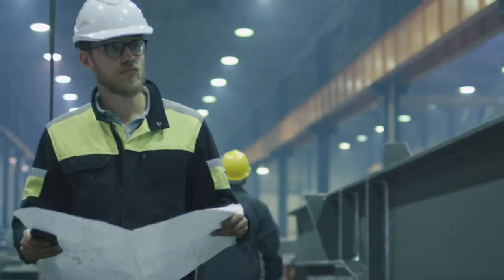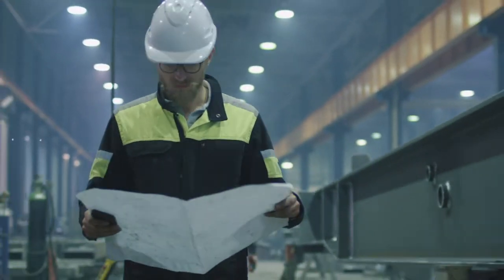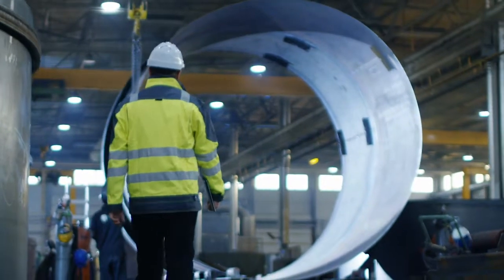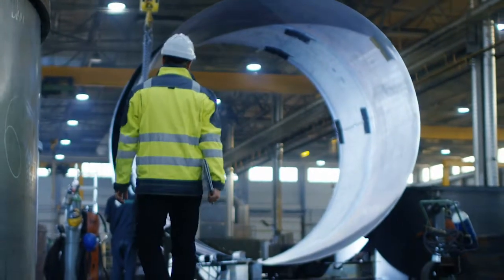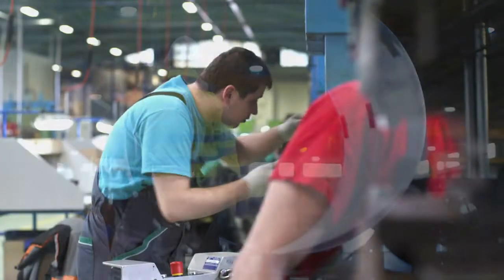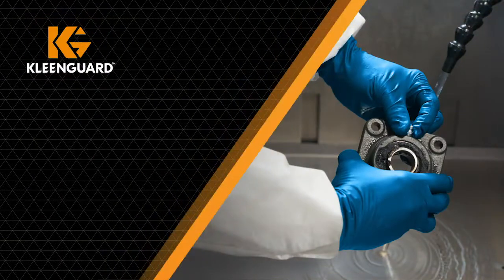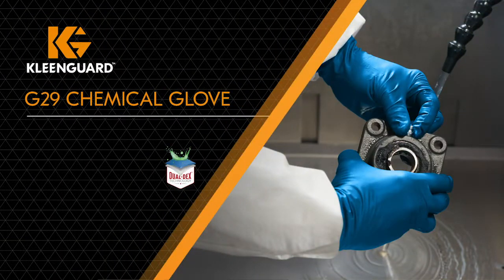Manufacturers everywhere understand the delicate balance between safety and productivity. Often the choices that enhance productivity can unintentionally place workers at risk. So are safety and productivity mutually exclusive? We don't think so, and the G29 Chemical Glove with dual-dex technology proves it.